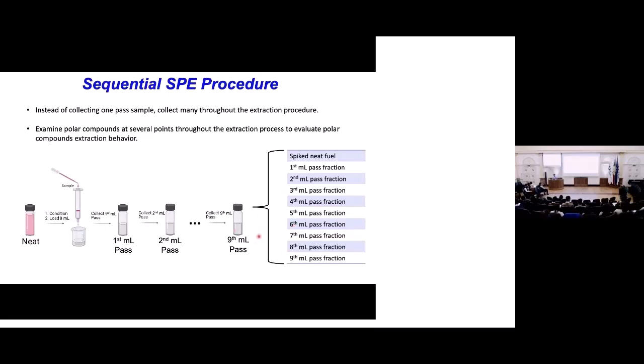And so this gives us a whole range of samples to study, not only to discover the compounds that are changing between each fraction, but to track their concentration and infer what their residence time on the SPE cartridges is and compare to different phases.